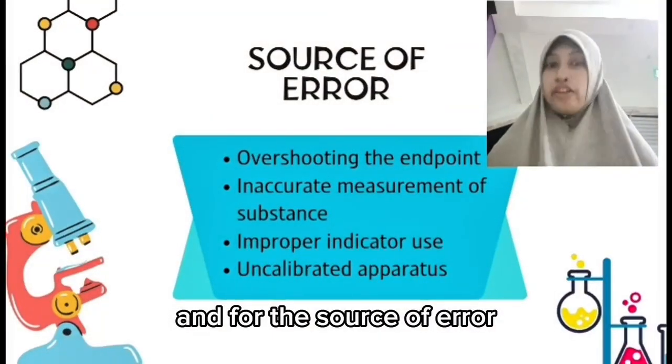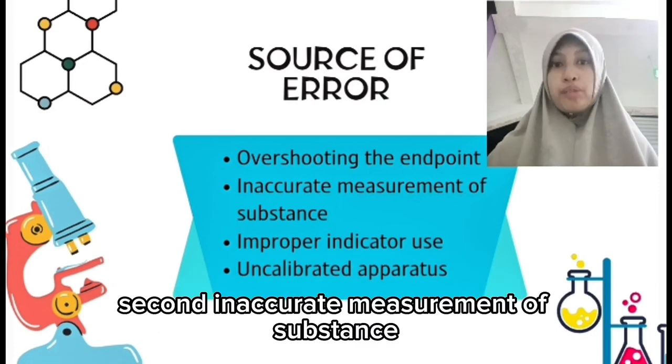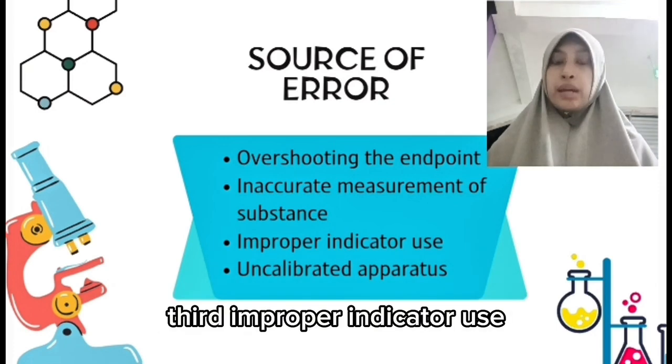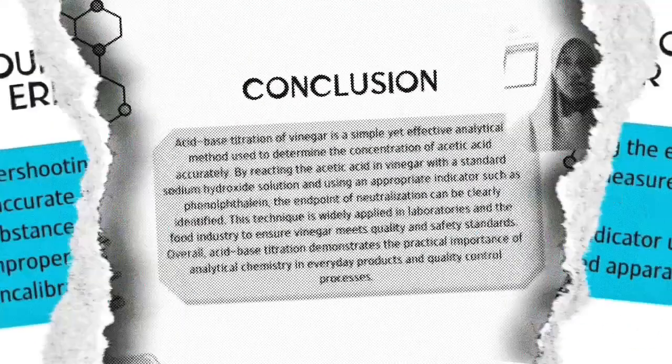And for the sources of error: first, overshooting the endpoint. Second, inaccurate measurement of substances. Third, improper indicator use. And lastly, uncalibrated apparatus.